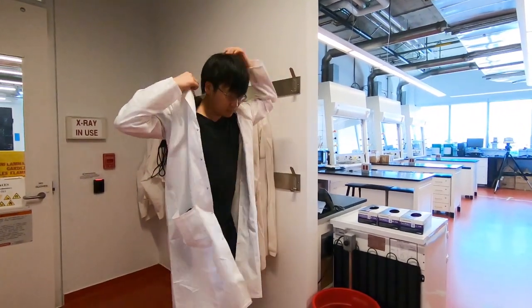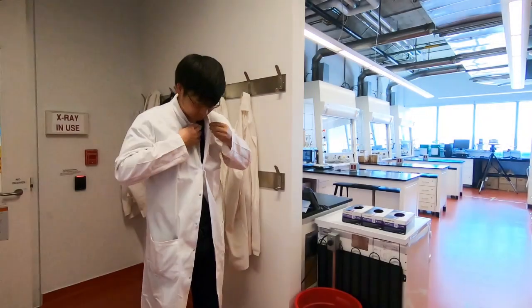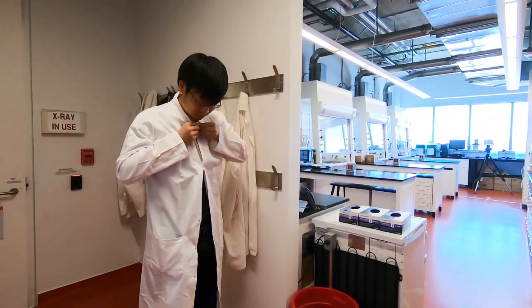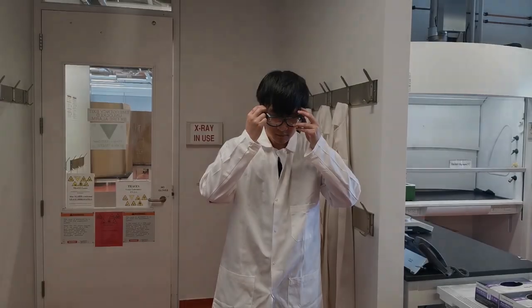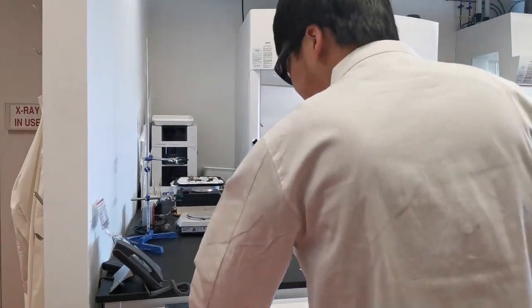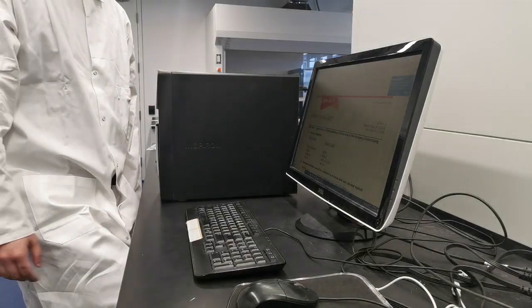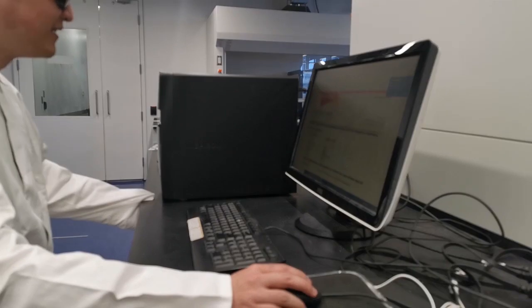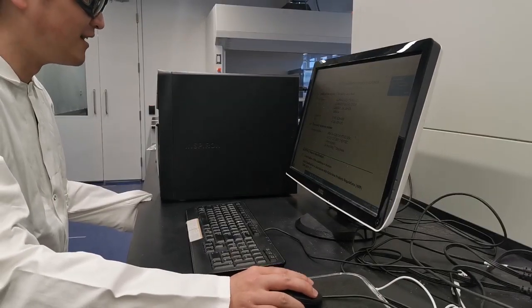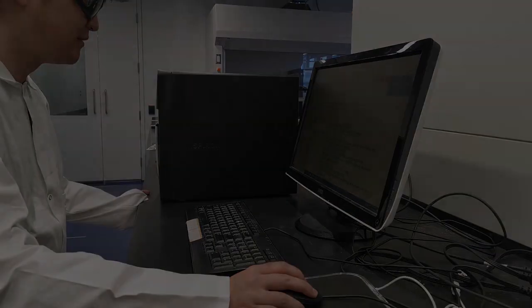transport. At a minimum, you must wear a lab coat, buttoned all the way down to provide maximum protection, safety glasses, and of course, gloves. Be mindful to check the corresponding safety data sheets to understand the associated hazards and determine any additional cautions you may need to take or PPE you may need for the transport.